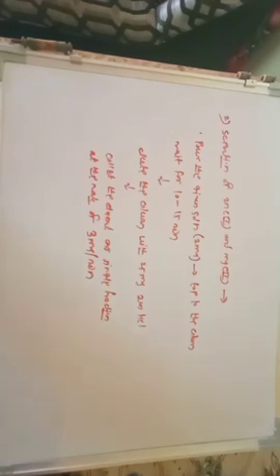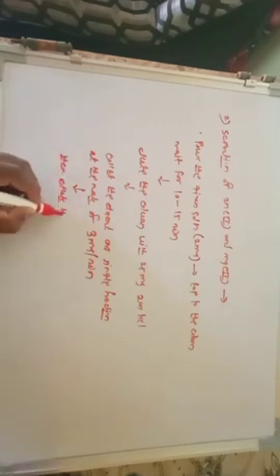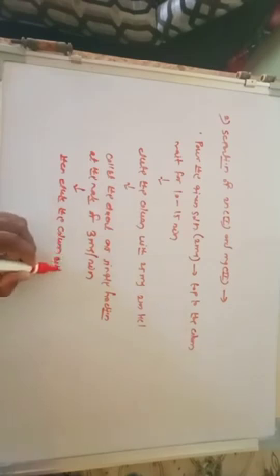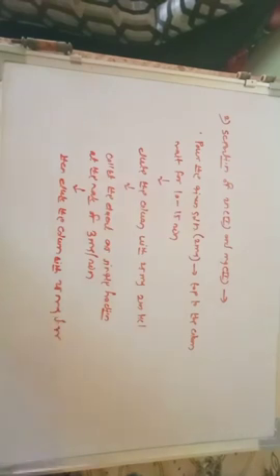Then elute the column with 25 ml of distilled water.